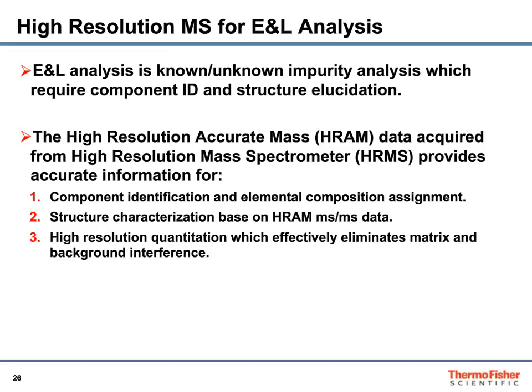Also, because the samples tend to be complex, especially the leachable samples, there are a lot of matrices and instrumental background. So high-resolution quantitation can effectively eliminate matrix and background interference.